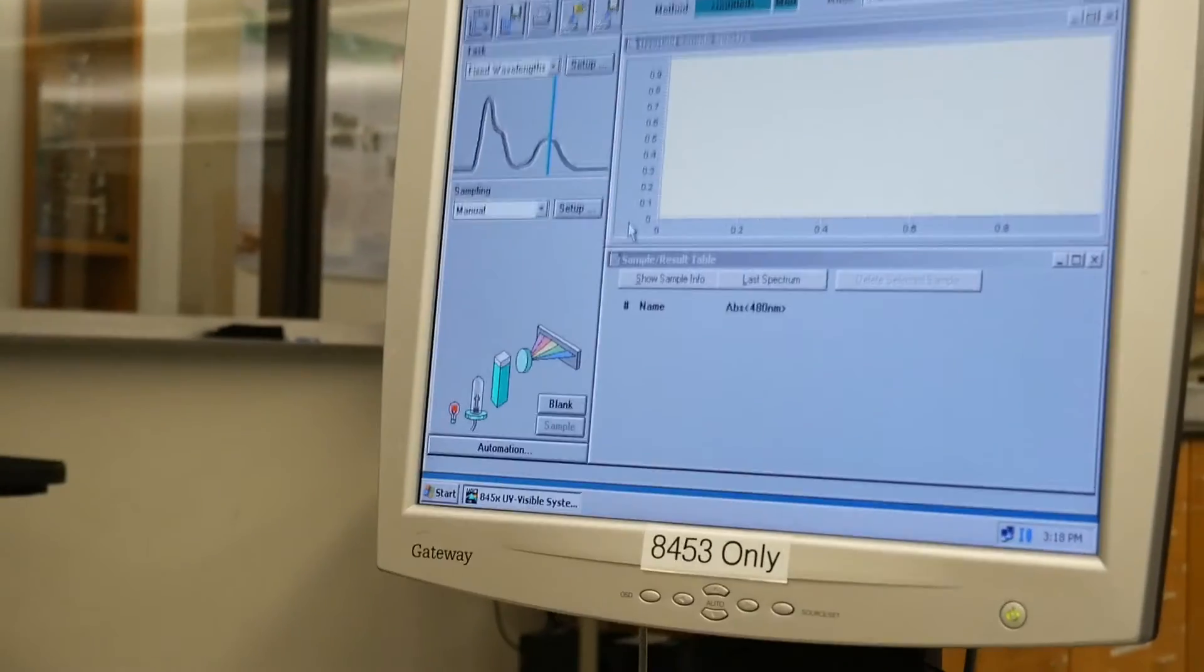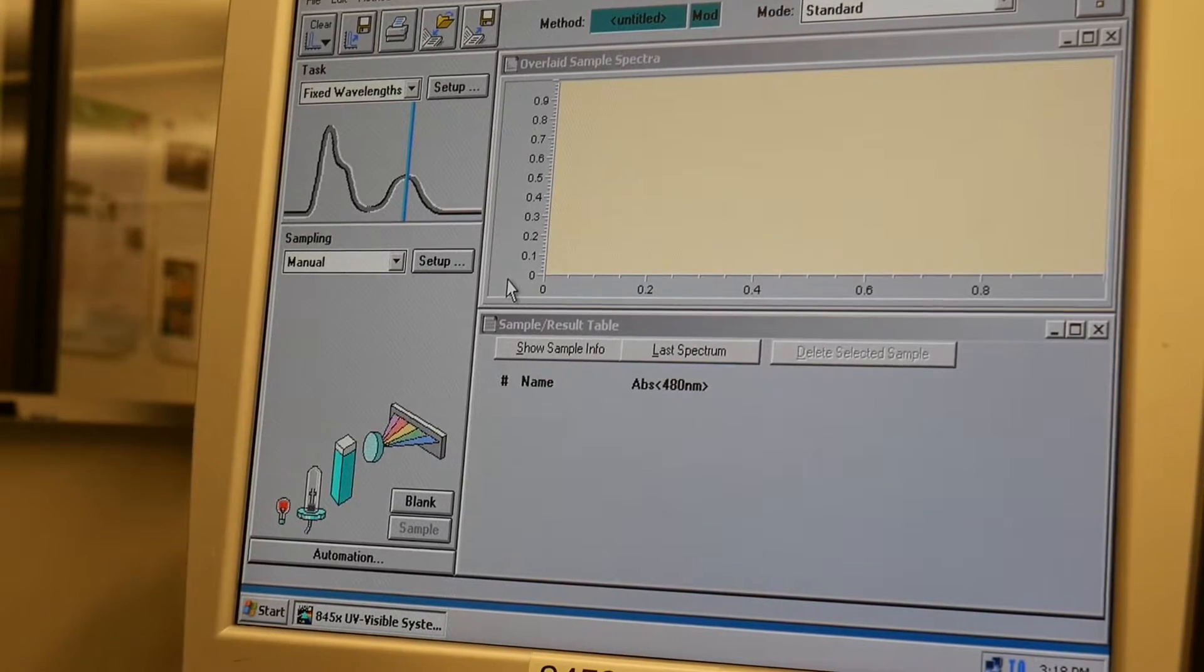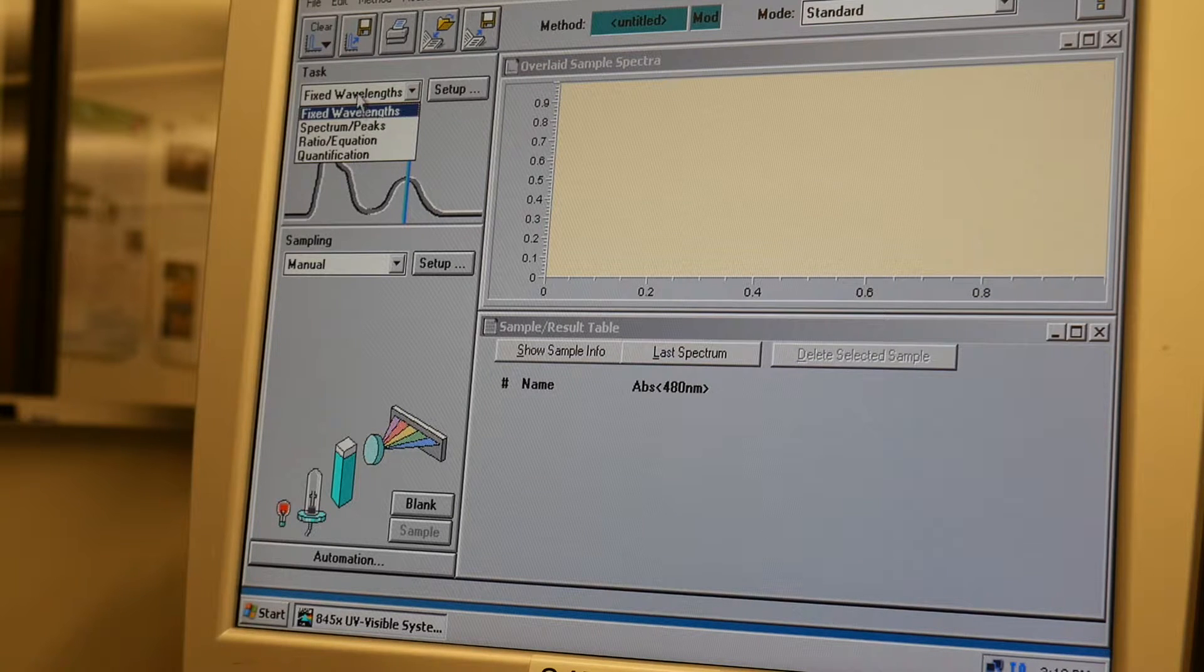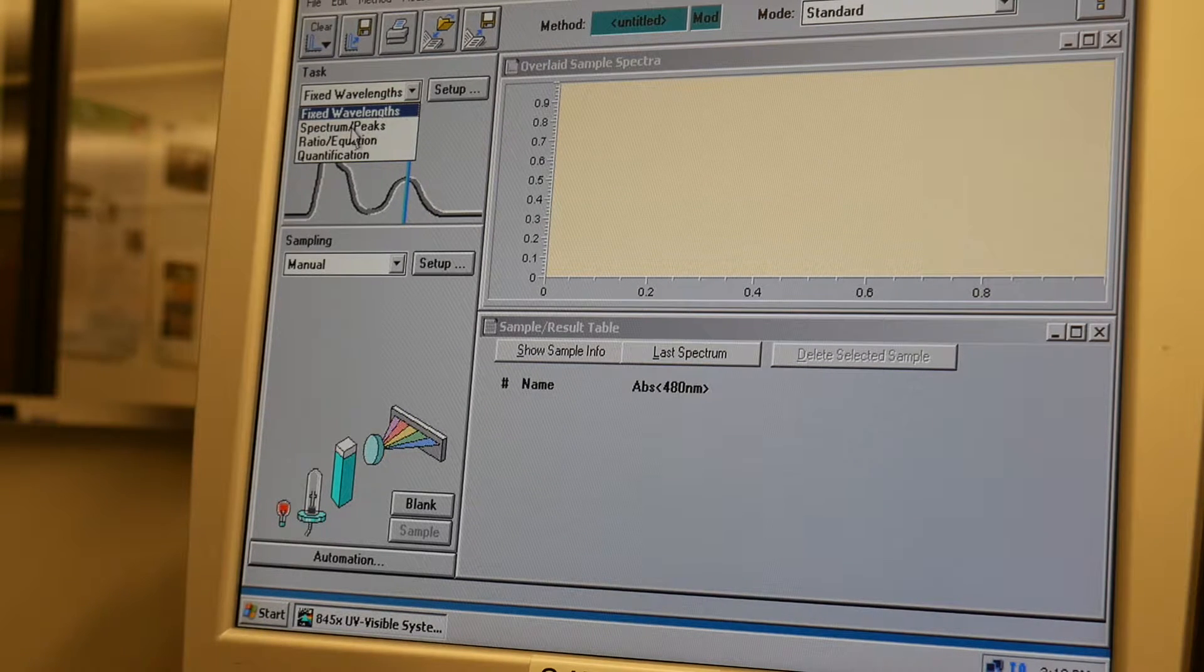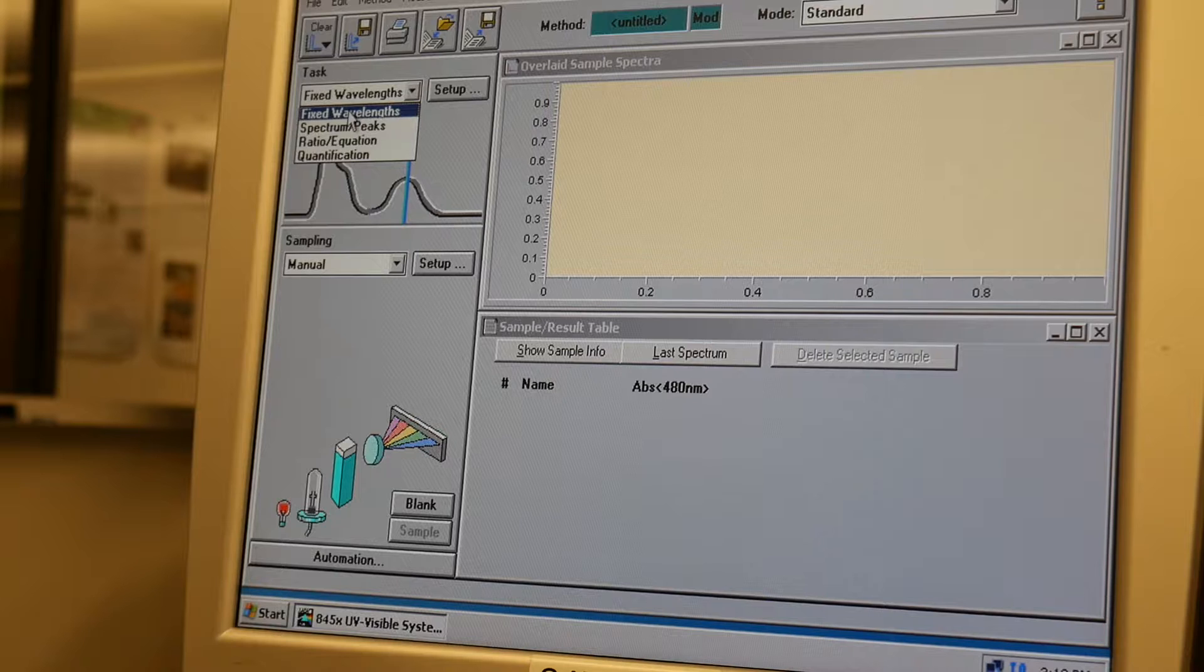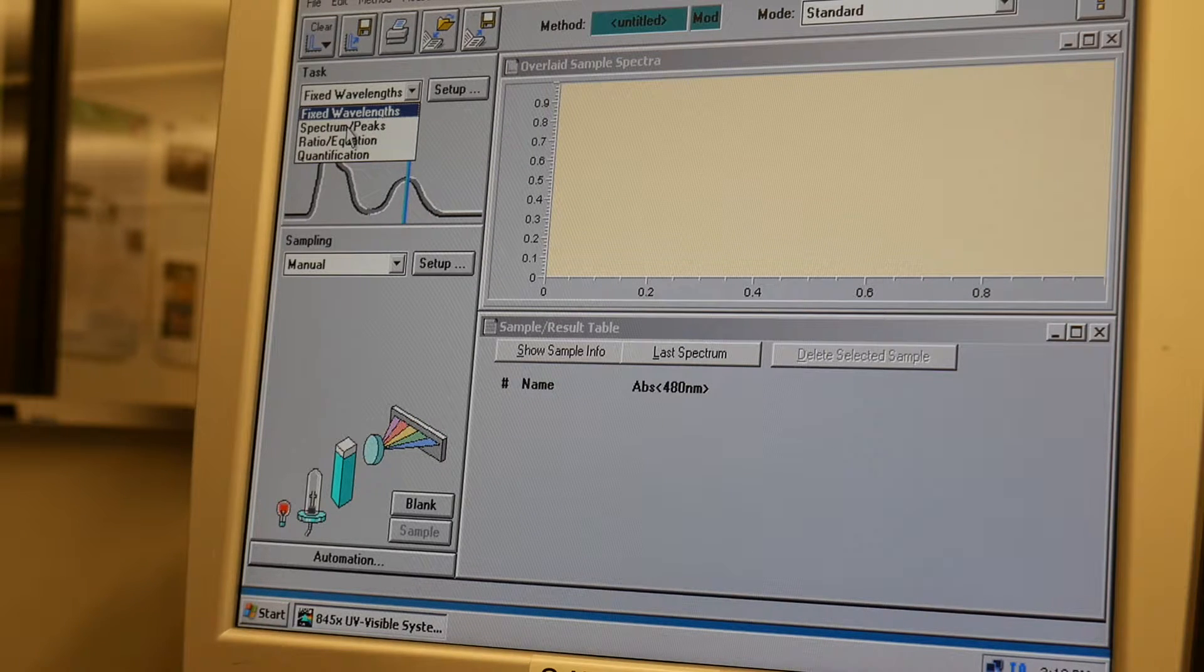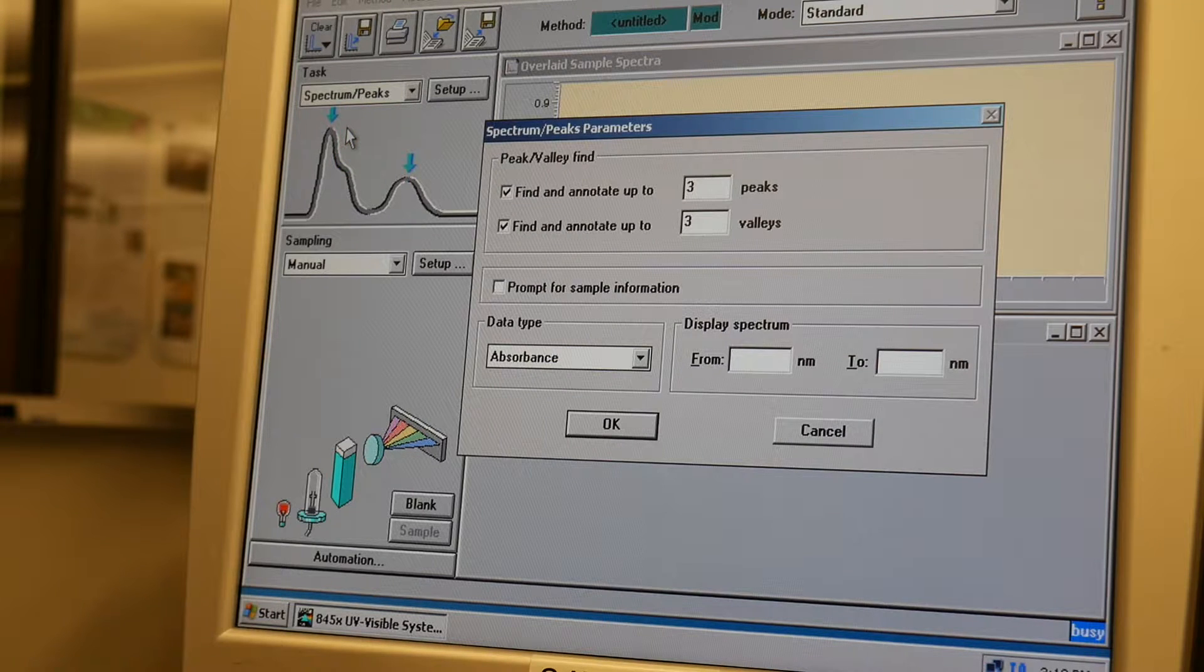So the next thing you want to do is you want to choose what task you're going to use. So there are four possible tasks, but we usually use one of the first two, either fixed wavelengths or spectrum slash peaks. So I'm going to start by showing spectrum slash peaks.